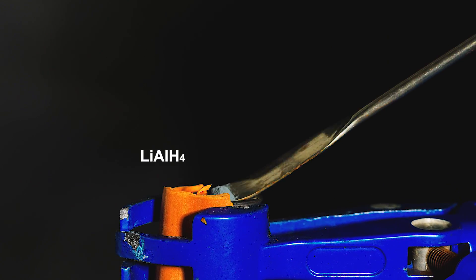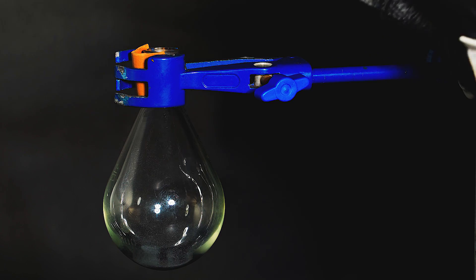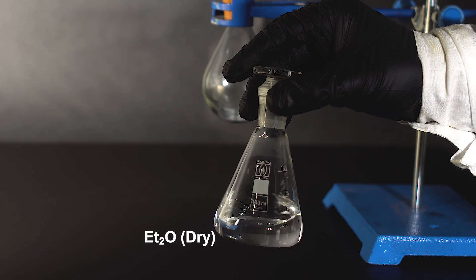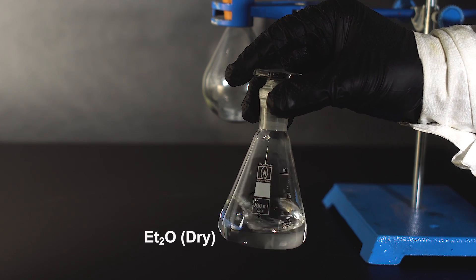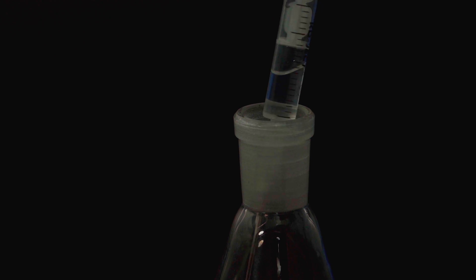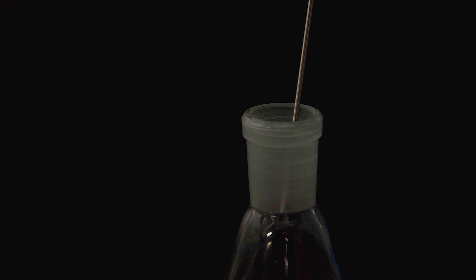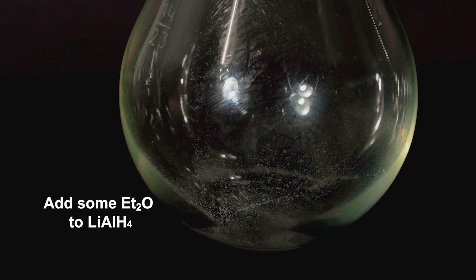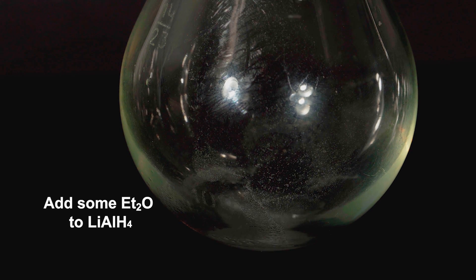We'll get germane by the reaction of lithium-aluminum hydride in dry diethyl ether and germanium tetrachloride. Diethyl ether must be absolutely dry, otherwise nothing will happen, because lithium-aluminum hydride will react with water a non-dried ether contains. Adding dry ether to lithium-aluminum hydride will not result in any gas emission whatsoever.